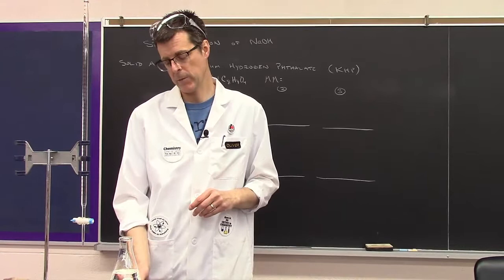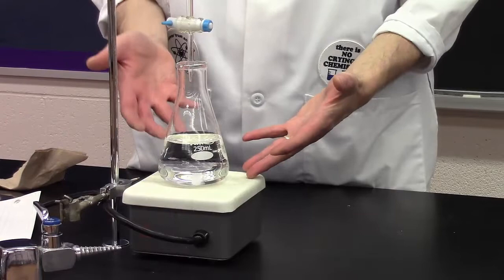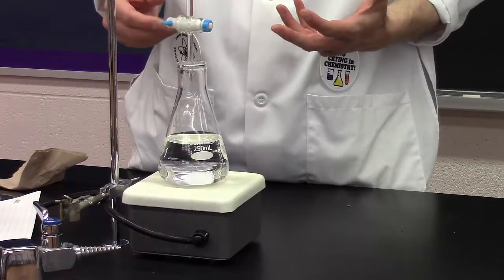I'm going to turn on the magnetic stirrer because I'm too lazy to swirl it. That's going to keep everything mixing well. So I've got the acid mixing with the indicator in it. I'm going to start to add the base. I don't know how much base I need to add, so I'm going to add it fairly slowly.